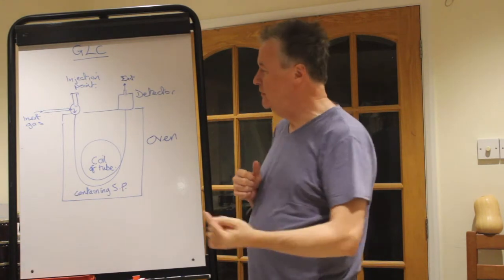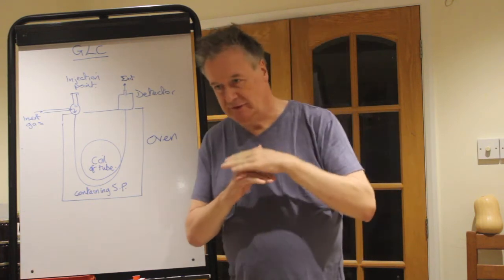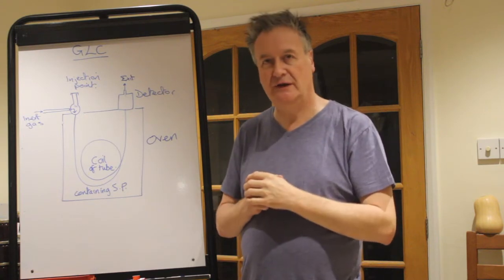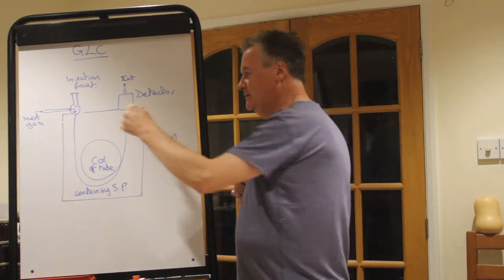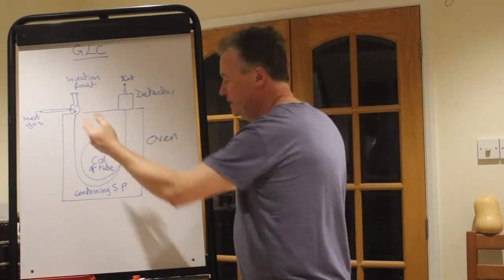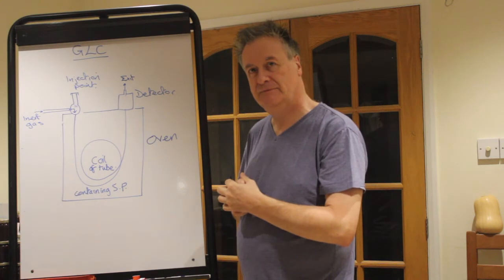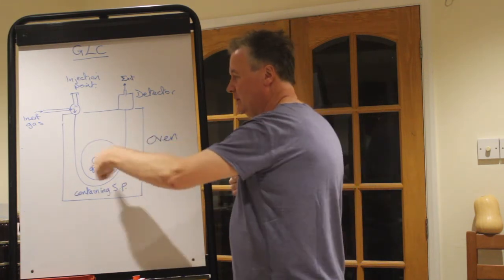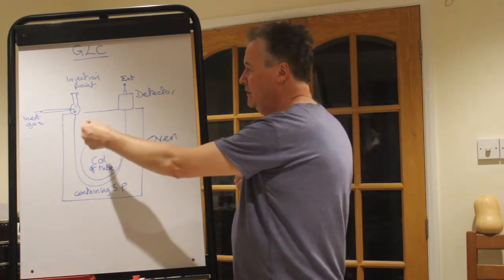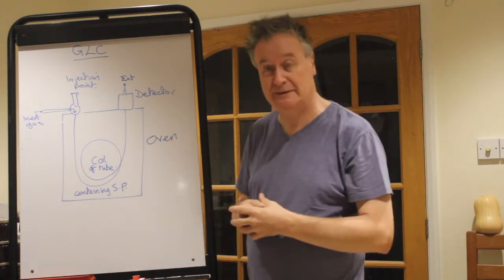Now the whole way it works is like that paper chromatography. In that paper chromatography, some colours go a long way, other colours don't go so far. It's the same idea. Some get through here really quickly by getting through with the carrier gas or the inert gas. Others get caught up on the stationary phase. And so as they go through, they're spending a lot of time interacting with the stationary phase, the oil. They'll take longer to come out. And we are talking minutes here. We aren't talking like poof, poof, poof, done it in a couple of seconds.